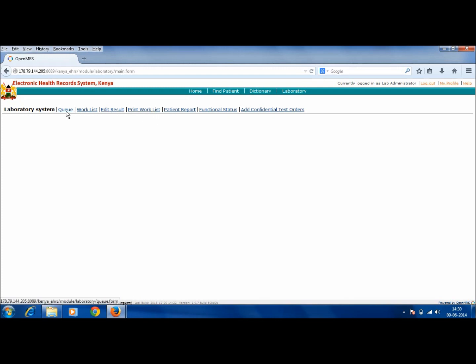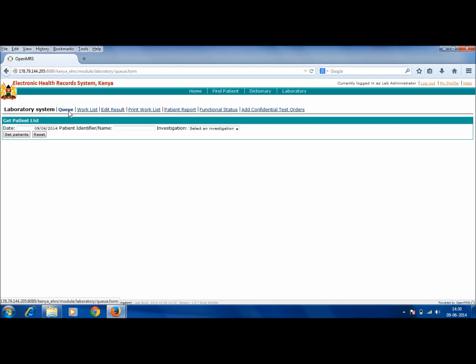Now the first option is Queue. This is the queue of all the tests that have been ordered by the doctor from the patient's dashboard. And in case of OPD, that is the outdoor patients, the patient has even paid for the particular tests.